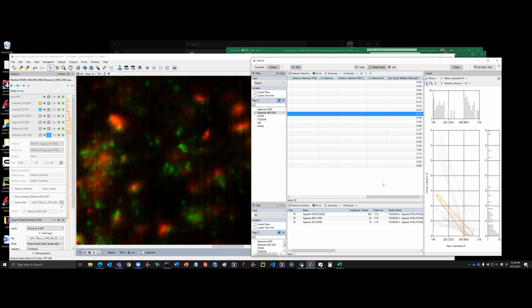This is just an example of how we can further customize the software and compute new features if we have to. The same way, once we have the sum of each of the particles, we can also create the ratio and immediately populate the Excel or CSV table with it.